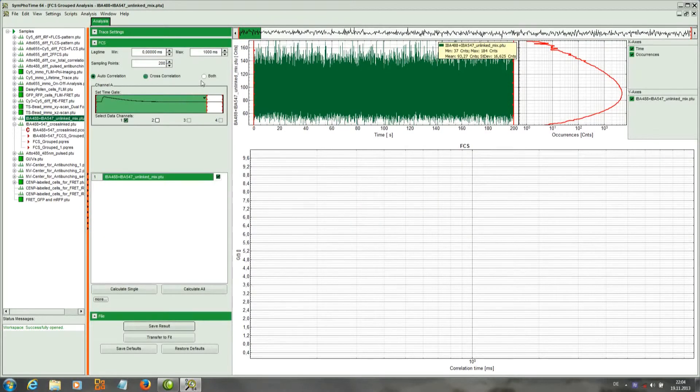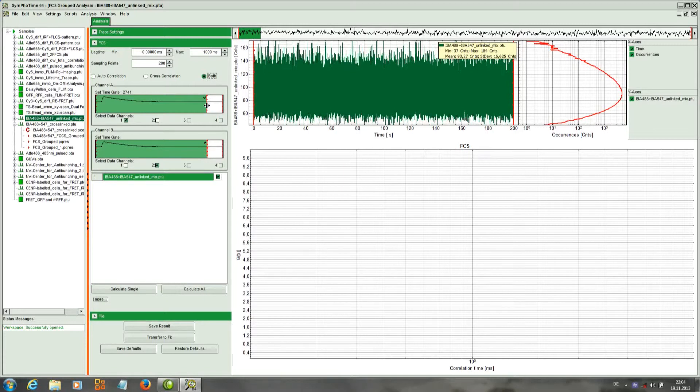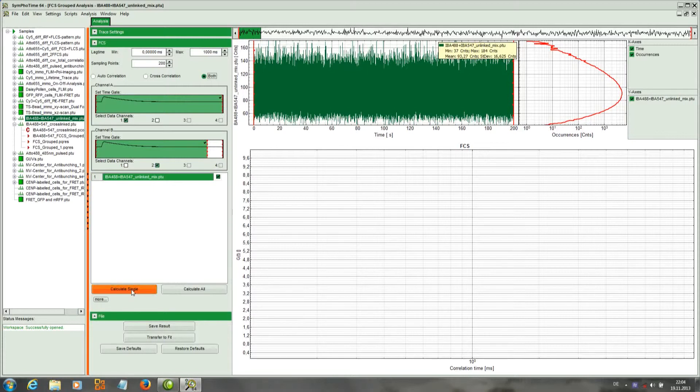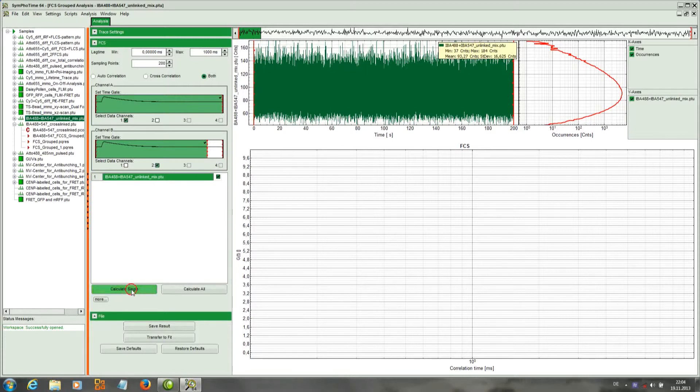Again, we select both to calculate auto and cross-correlation, and we adapt the time gate to basically the same settings as before. Again, we calculate single.